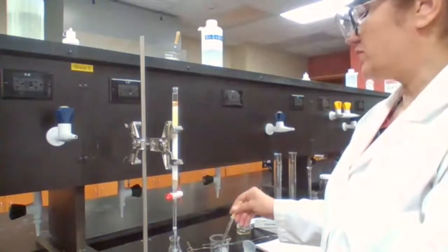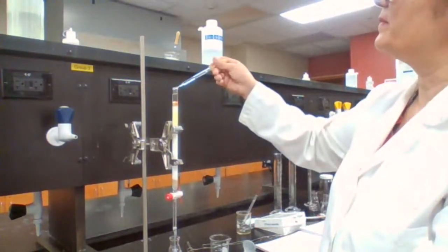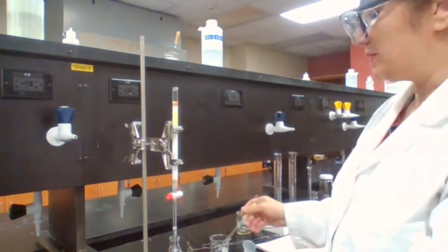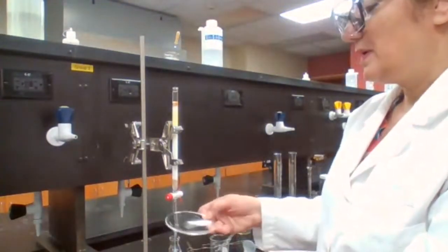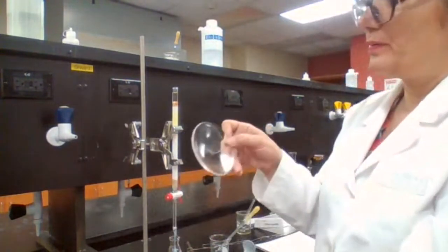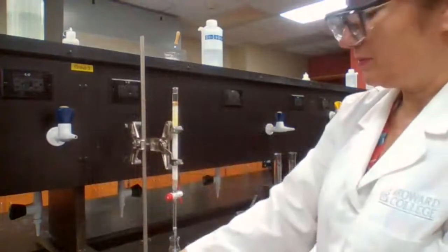Hexane acetone mixture, because I'm trying to increase the polarity of my solvent. Acetone has a C=O double bond, and the C=O double bond makes the molecule more polar. Okay, still white residue.